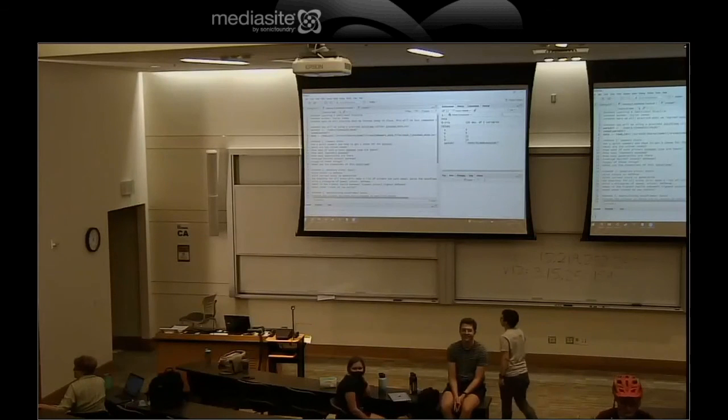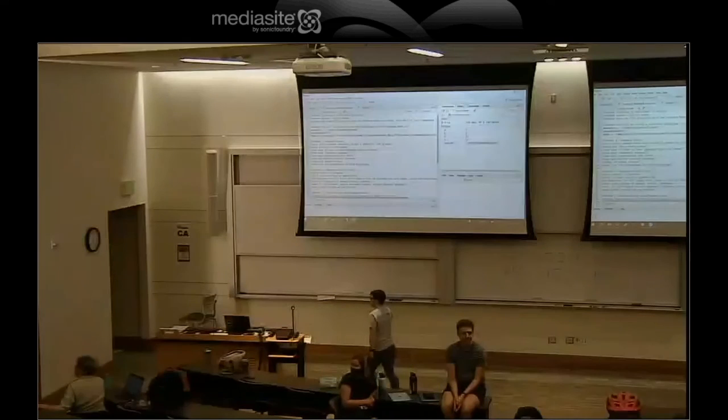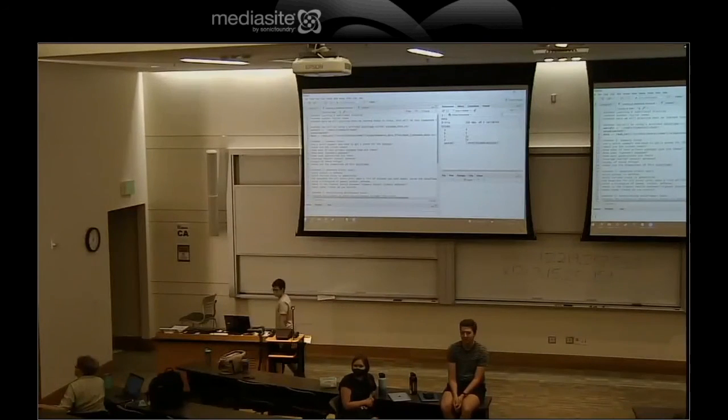It says this part is out there, but it is. Sometimes I do that, and then it's like, oh, this one needs these other ones. So do you install packages? There should be a flag for update. Flag for install packages for update. So you can try.